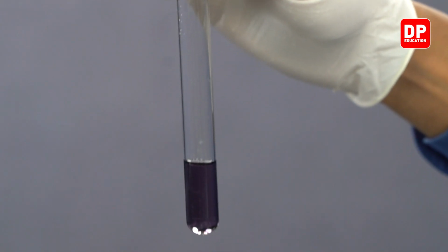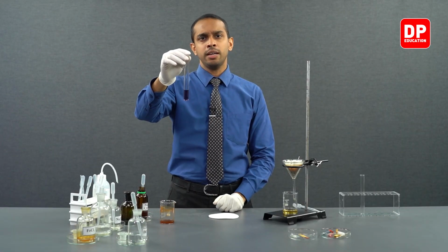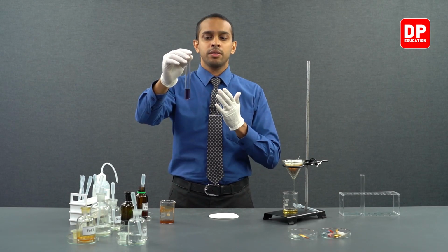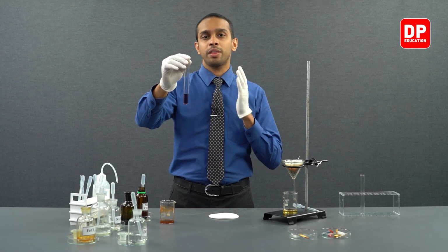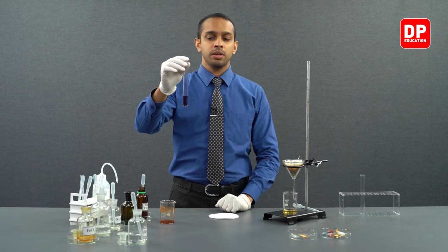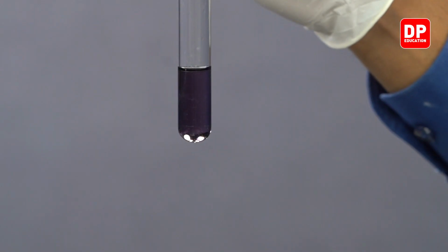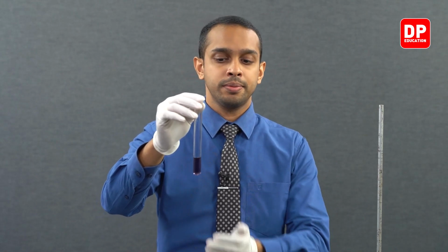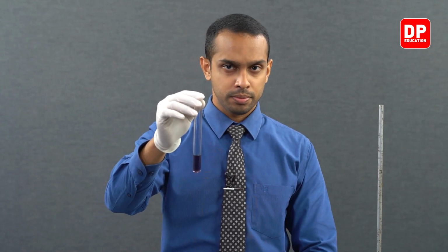Now this violet color solution was formed due to phenol reacting with ferric chloride solution and forming phenoxide anions. The phenoxide anion and Fe3+ ions form a complex that is purple, or violet, in color. That is why you observe a violet color when you react neutral ferric chloride with phenol. So we can use this test to identify phenol.